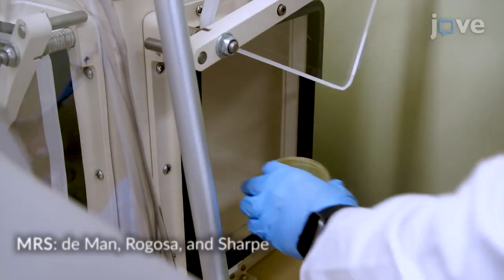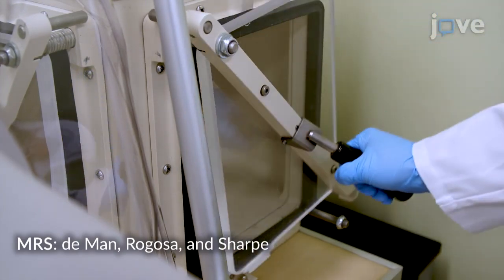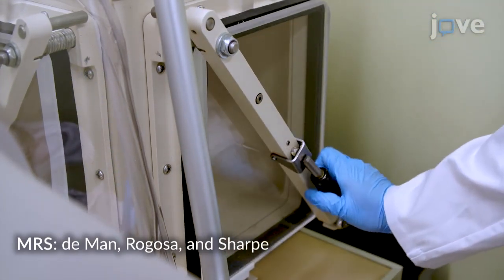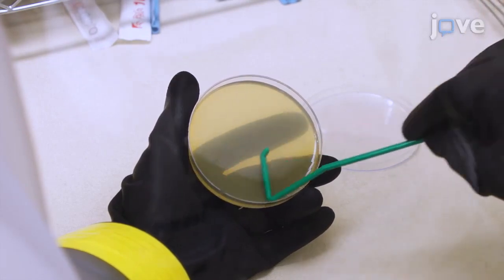Begin by placing an autoclave-sterilized MRS agar plate in a 37 degrees Celsius hydrogen anaerobic chamber with 20 parts per million oxygen and inoculating the plate with freshly thawed Lactobacillus bacterial stock.